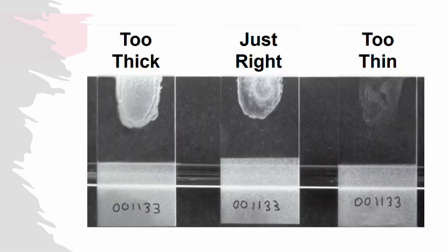Now, this slide shows you the right thickness as you produce the coiled smear. We avoid too-thin smears because they can be washed off in the staining procedure. Too-thick smears we should also avoid because they will overstain and cover the bacteria that we need to detect. So we need to observe the proper thickness.